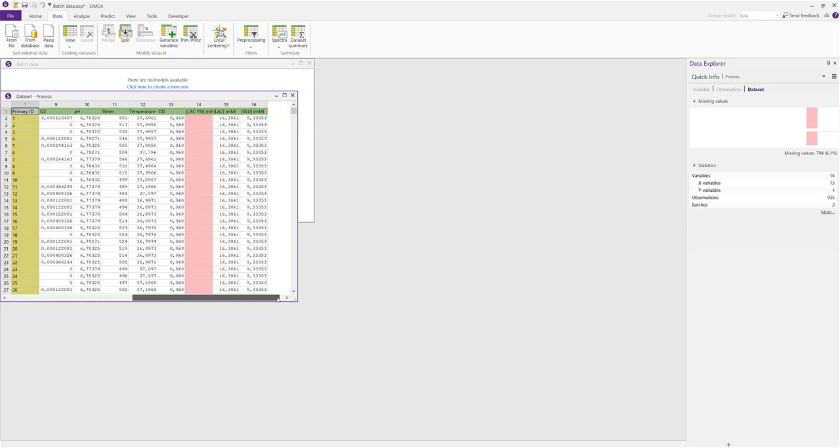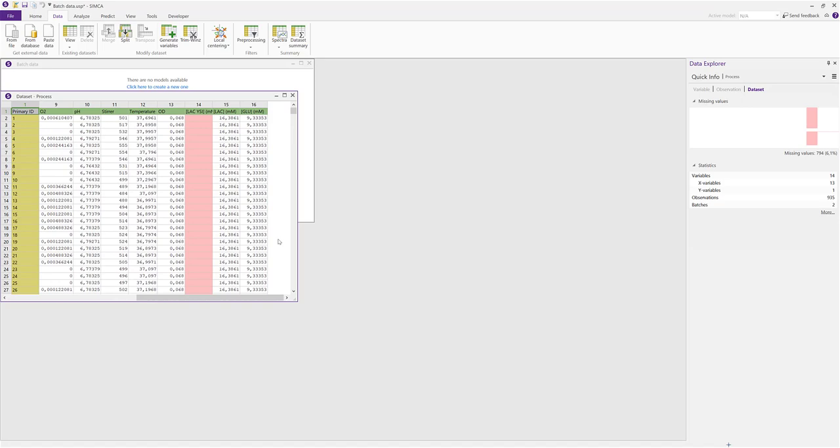Let's now try the second type of merging, the top bottom merging. In this example, we have two NIR data sets with different wavelength resolution. The master data set has a resolution of every second nanometer, and the additional data set has a lower resolution, every fourth nanometer. What we want to do is to merge these two data sets with each other in such a way that we keep the higher resolution and interpolate the values missing in the lower resolution data set.